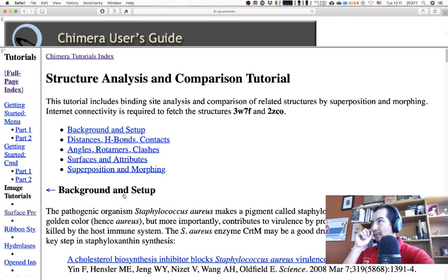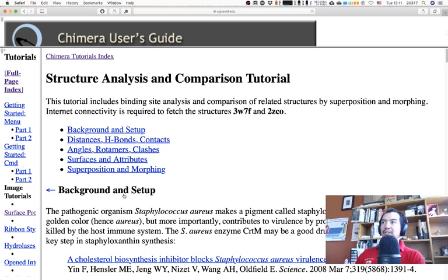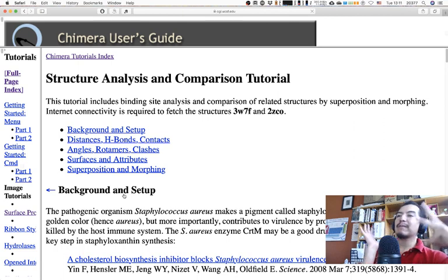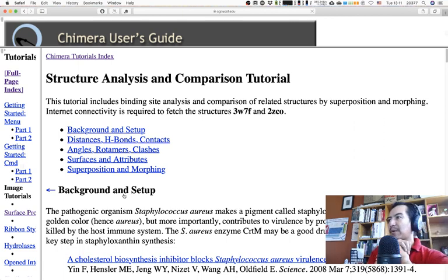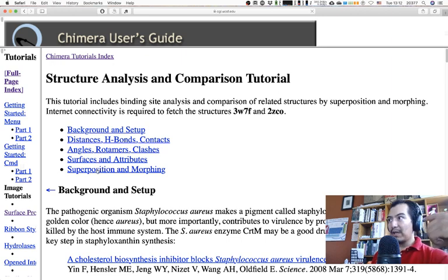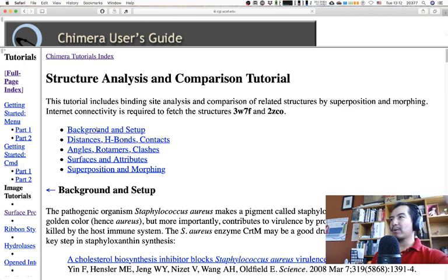This tutorial includes binding site analysis and comparison of related structures by superposition and morphing. The morphing is going to be the most difficult part; the rest is going to be fairly easy. Here we have the background setup: distances, angles, rotamers, clashes, surfaces, and attributes. Let's start there and take it one bullet point at a time.